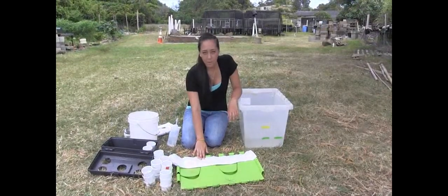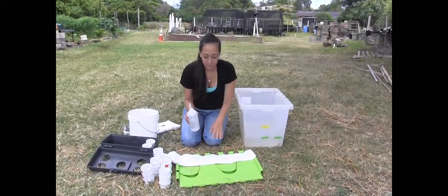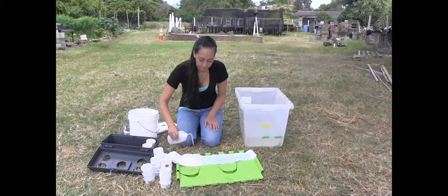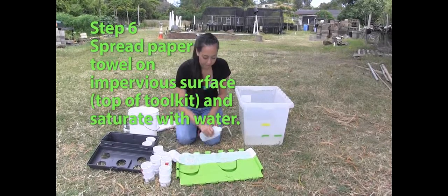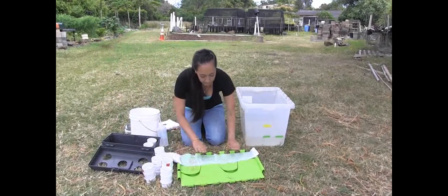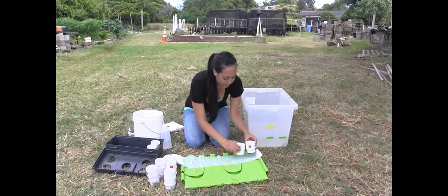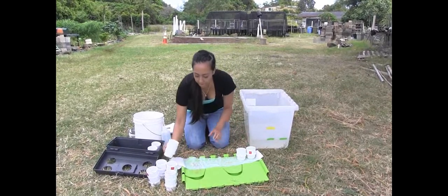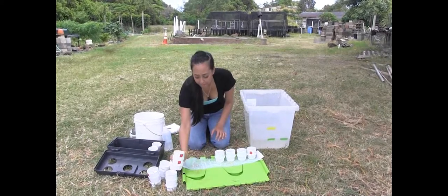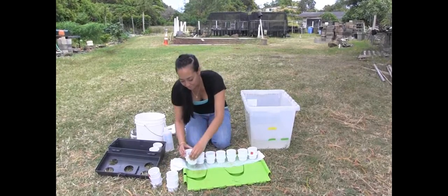So we have our paper towel on our impervious surface and we're going to use this squirt bottle and we're going to saturate the paper towel. Once the paper towel is saturated, just make sure there's no puddles of water, and then we're just going to place our sieves on it — you're going to place both the 250 micrometer sieve and the 53 micrometer sieve on here, just in case any of the soil fell through.